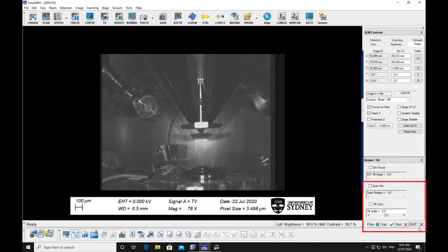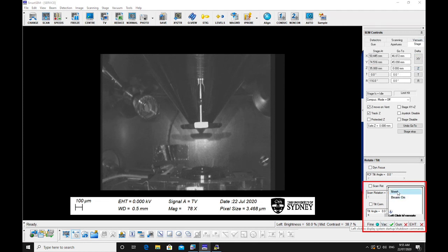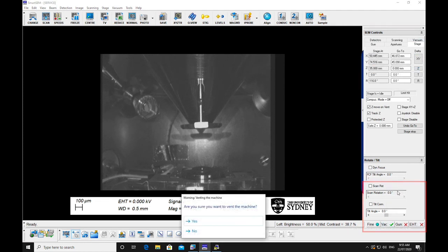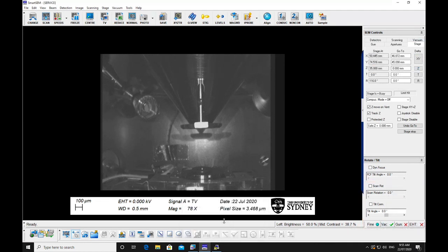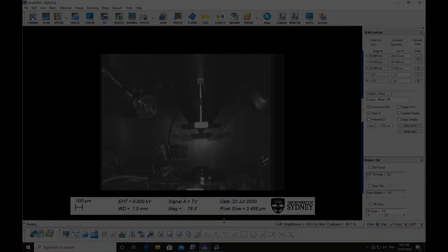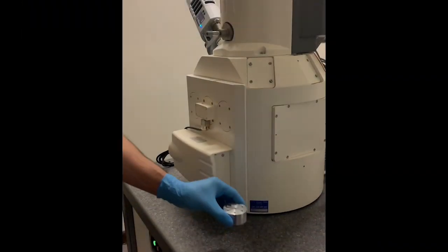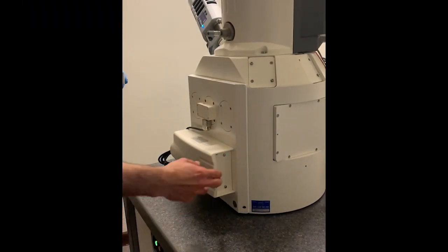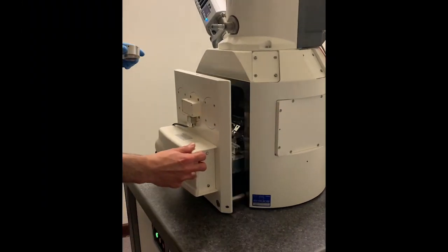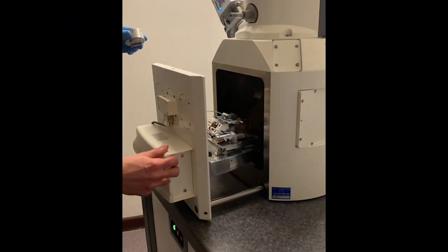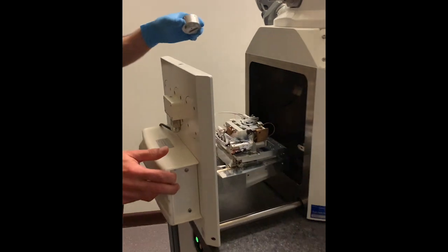Click on the vac button and select vent to vent the chamber. This will take a few minutes to vent. Once the chamber has vented, carefully open the door with your ungloved hand.